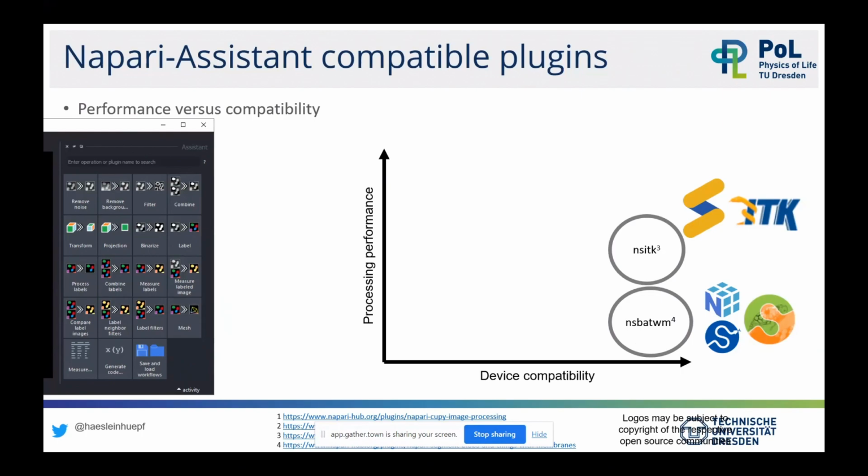One problem which comes with having different plugins, where some work and others don't, is, for example, device compatibility. Most of the tools in napari-segment-blobs-and-things-with-membranes are compatible with most computers I've seen. napari-simpleitk, you see this circle is a tiny little bit more on the left. I have seen some exceptional computers where napari-simpleitk does not work.